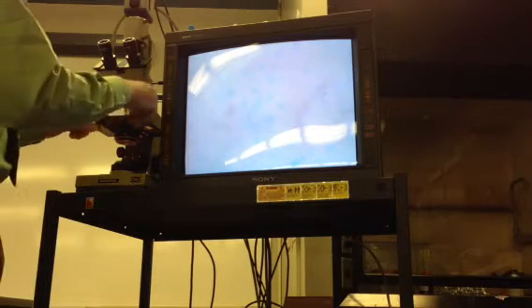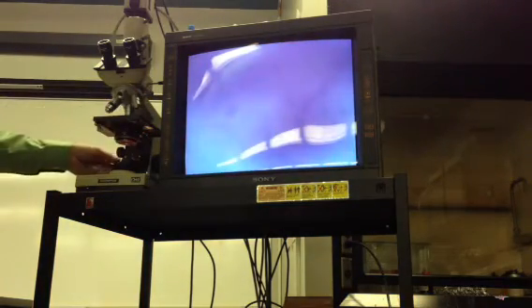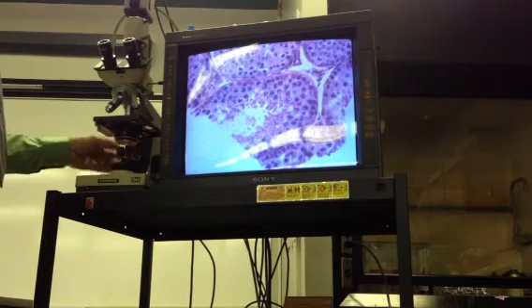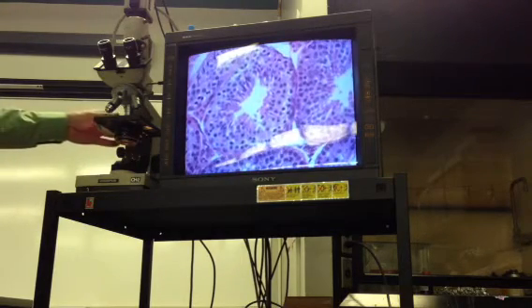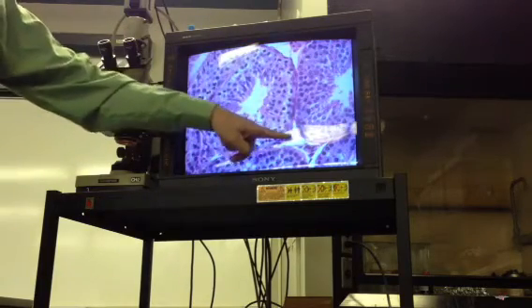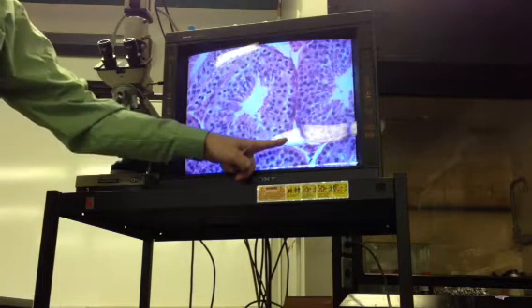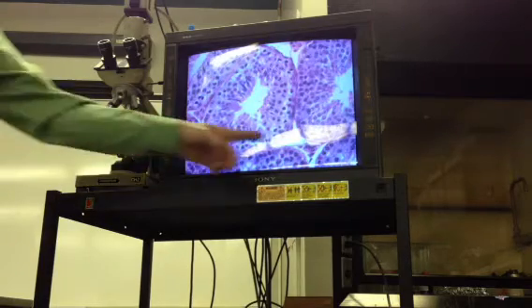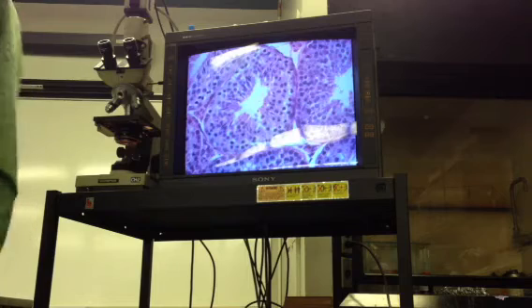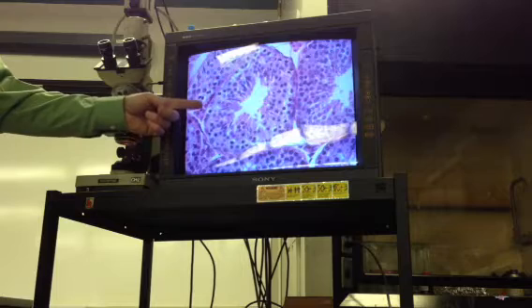Okay, male testis. There we go. Seminiferous tubules, right? So there you have a seminiferous tubule. There you have a bunch of Leydig cells, or interstitial cells. There are two bunches of them here. LH stimulates them to make testosterone, which diffuses in very high concentrations.